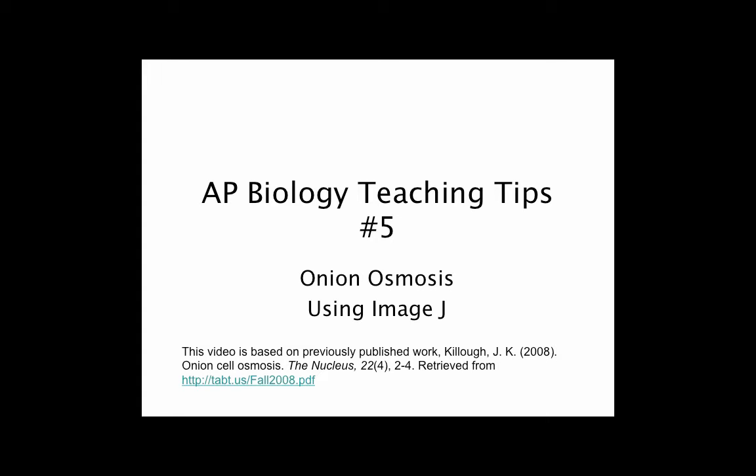This activity provides a jumping-off point for student inquiry. It also adds a tool to both teacher and student toolbox. ImageJ can make measurements on any picture, making it useful for a variety of data collecting needs. I hope you give it a try.